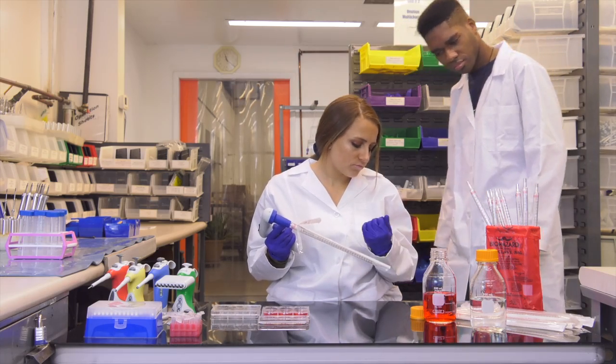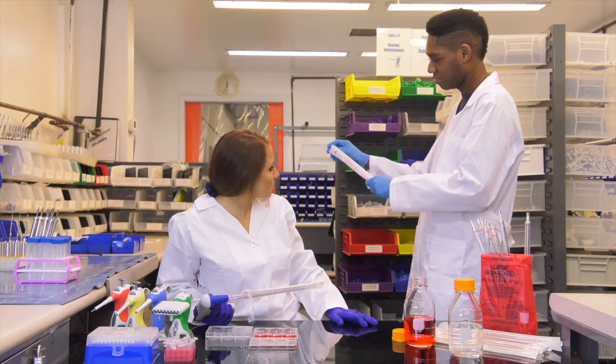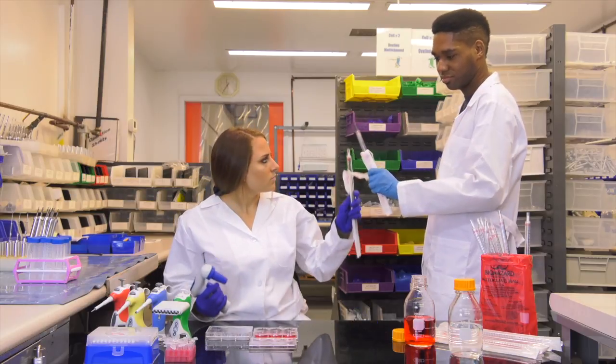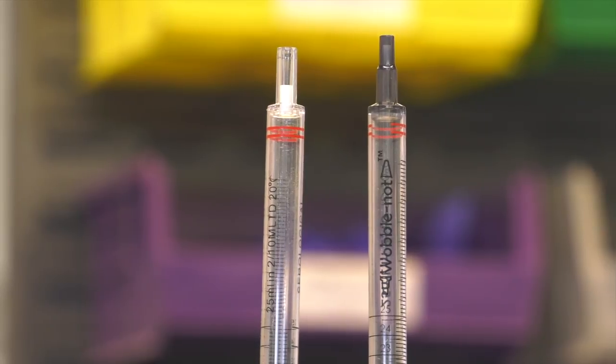Don't wobble, don't jam. Use Wobblenot. With the new, never-before-seen two-tier step design that works with any of your pipette controllers.